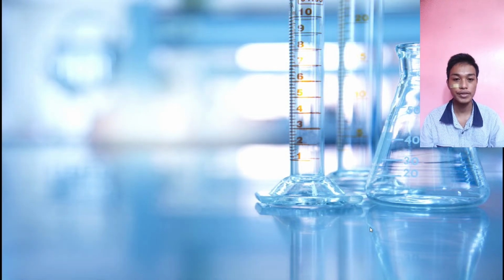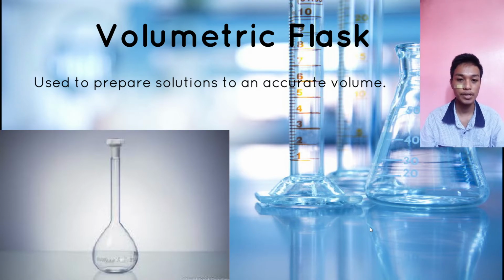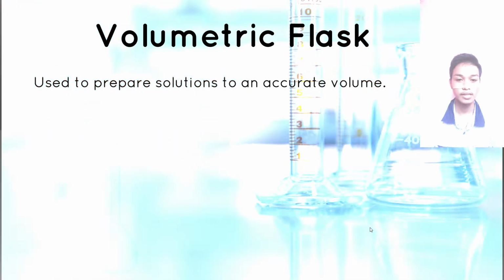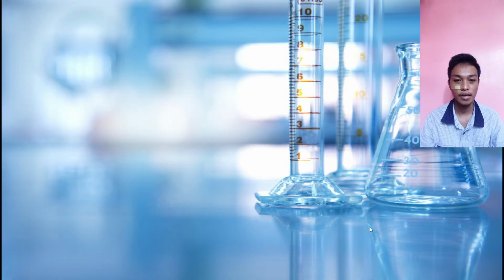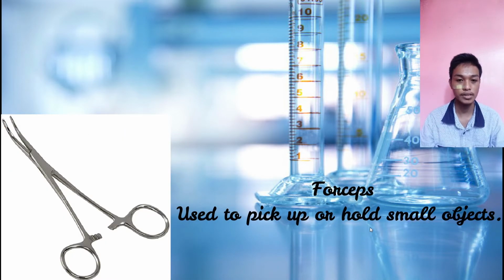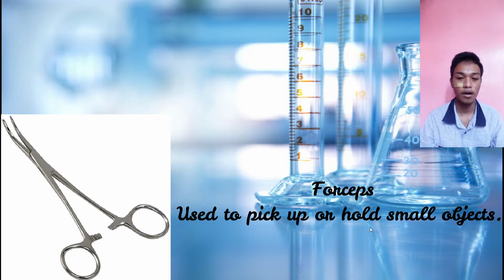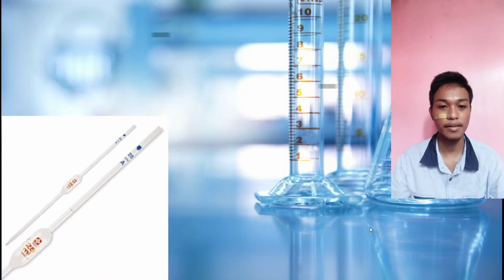Next is the volumetric flask. It is used to prepare a solution at an accurate volume. The volumetric flask measures much more precisely than the beaker or the Erlenmeyer flask. Next is the forceps. It is used to pick up or hold small objects. These small objects may be too small to be held by hand, or it may be dangerous to hold them with bare hands.